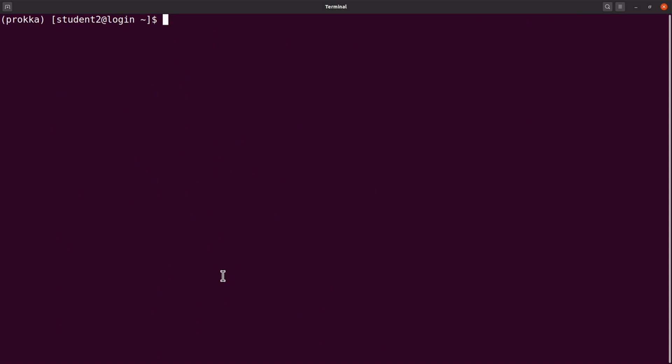So now it's time to use Prokka. So what we do is to first call Prokka, then we specify cpus which is 4. So the cpus here will allow Prokka to use a specified number of cpus for the genome annotation.